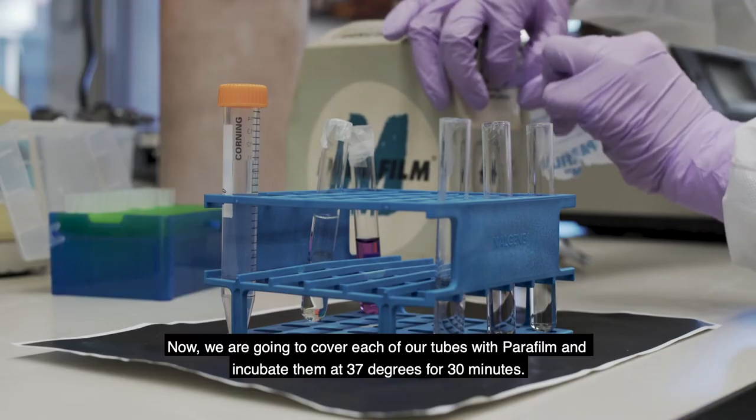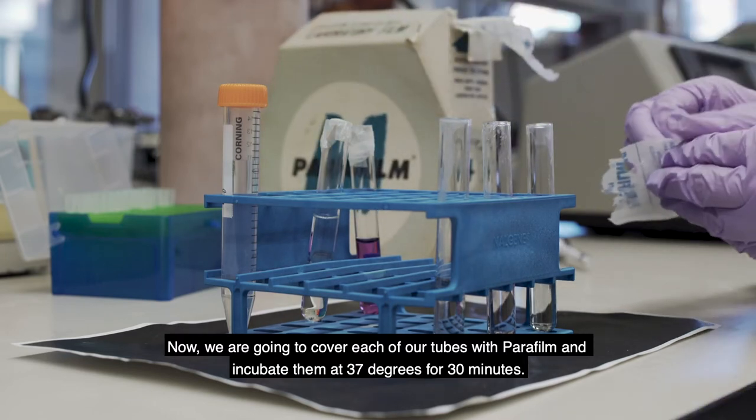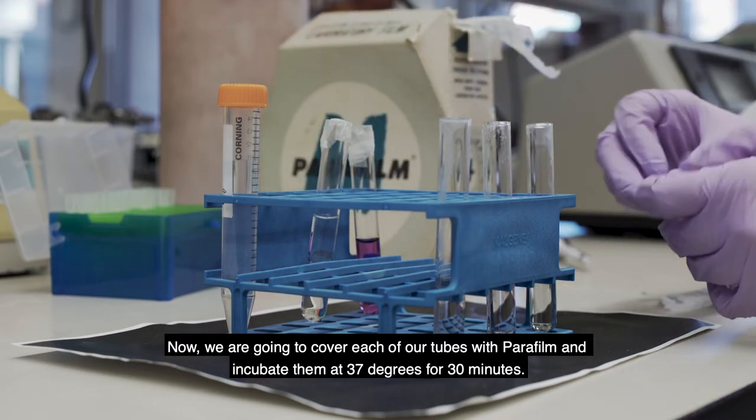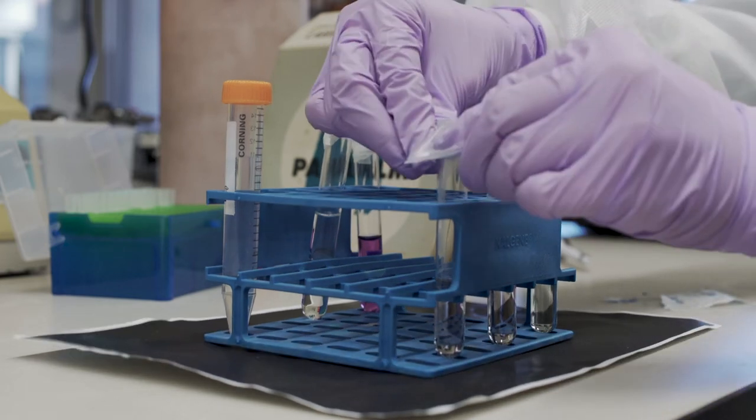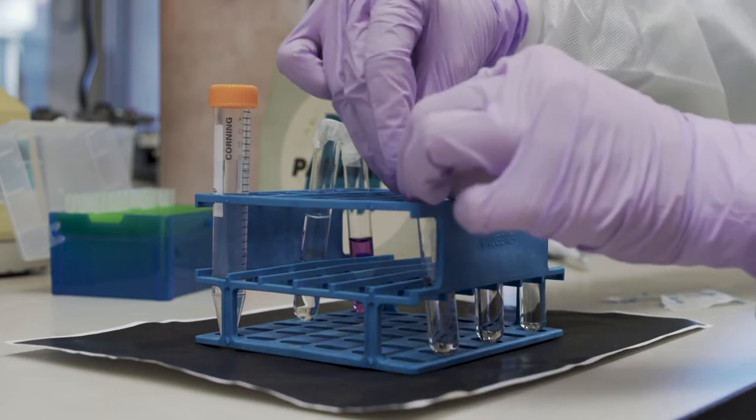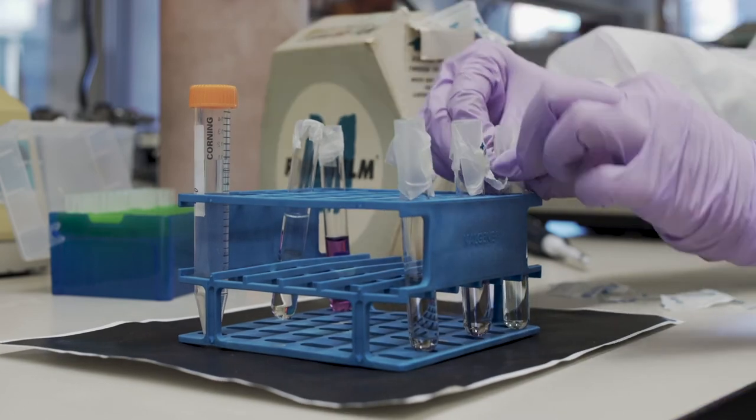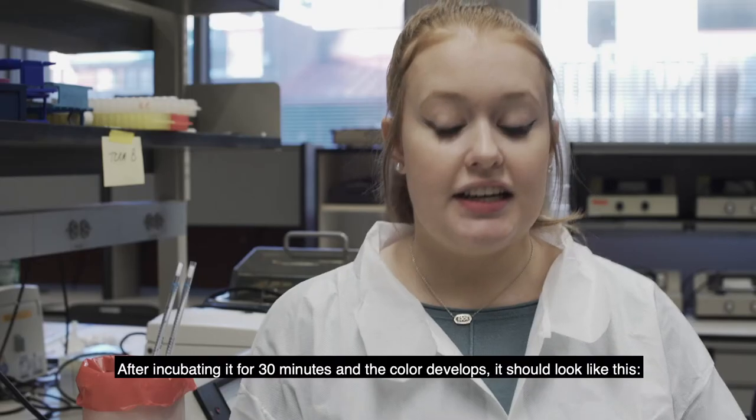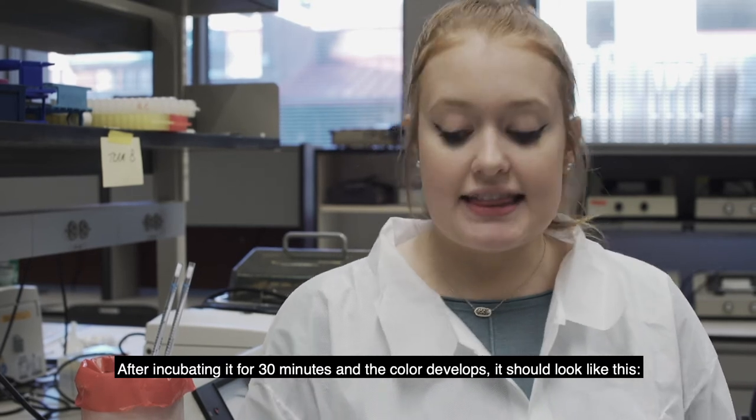Now we're going to cover each of our tubes with parafilm and then incubate them at 37 degrees for 30 minutes. So after incubating it for 30 minutes and the color develops, it should look like this.